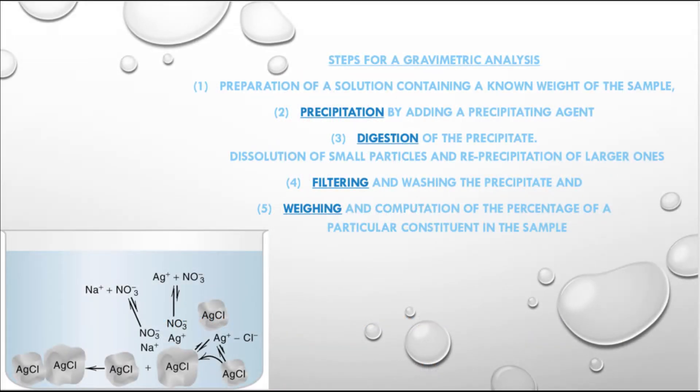In this video, we are going to show you how to precipitate, digest, and filter a salt sample to complete the gravimetric analysis of unknown G.